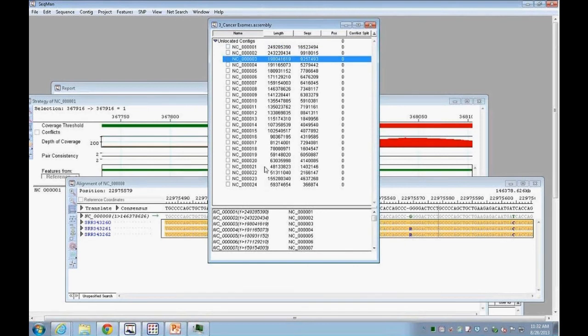Some of the... do we have a question? Yeah, Matt, before we get a little further into SeqMan Pro here, we do have one question on SeqMan Engine. The genome template packages that we looked at earlier in importing, what if somebody's working with an organism that isn't in the DNASTAR list of genome template packages?